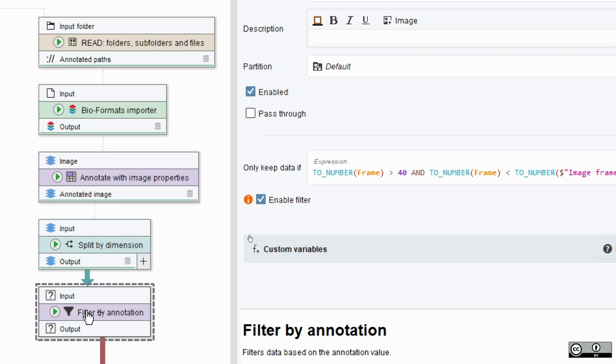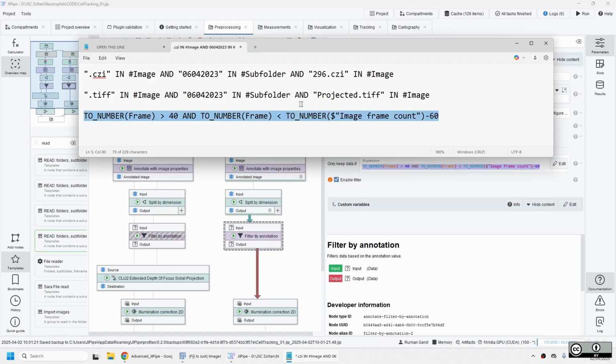There are other ways to do this using hyperstack cutting, but this actually works quite easily and is easy to understand. And basically what we did was we put in this annotation. Namely, I said, for today's lecture, I would like you to see what happens between time point 40 and time point, the total number of frames minus 60. I knew it was 120, so this is going to be 60.